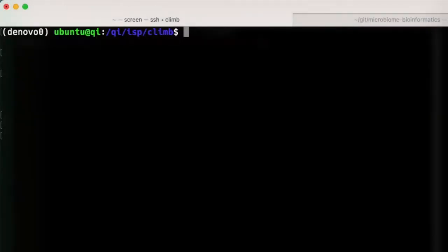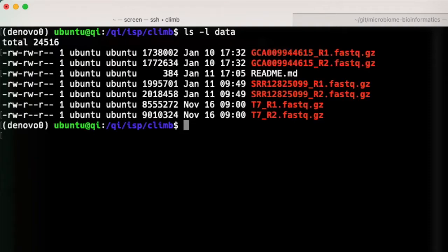Let's test our pipeline using the small dataset provided with the repository that you can download with getdata.sh. Its content will be placed in the data directory. We will provide to the pipeline the input path and the pattern to recognize the paired end reads, so it's a good idea to test the pattern with ls first.